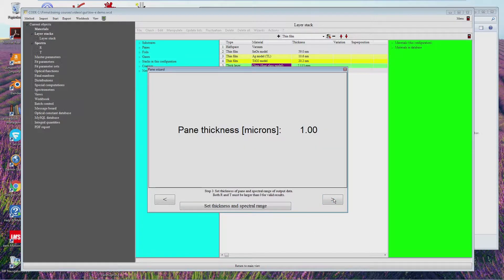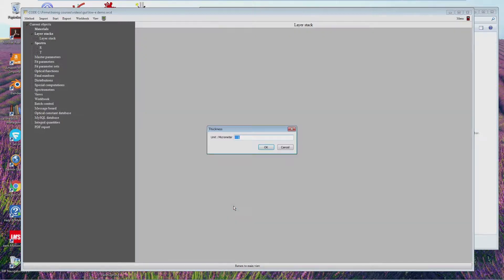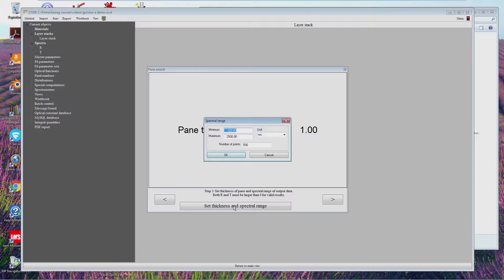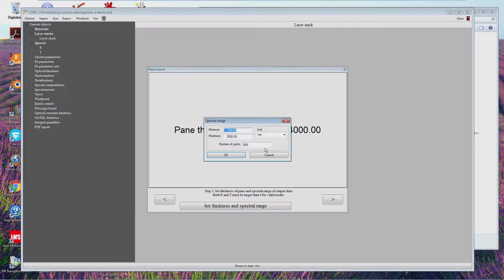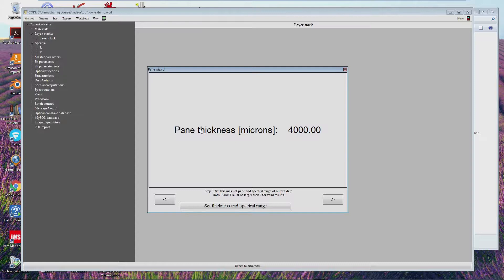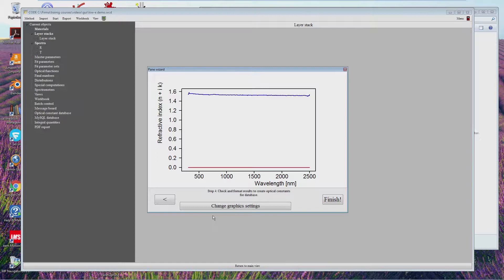The next step is to set the thickness and the spectral range. We have to click this button and type in the thickness of the glass in micrometers — this is 4 millimeters, so it's 4000. Now we have to set the spectral range for the analysis. Here we have to try a little bit. If we start at 250, which is where the experimental data starts, we will get an error message saying that the reflectance or transmittance is too close to 0. So we have to do it again. If we increase the minimum from 250 to 300, there's no warning anymore, so that seems to have worked.